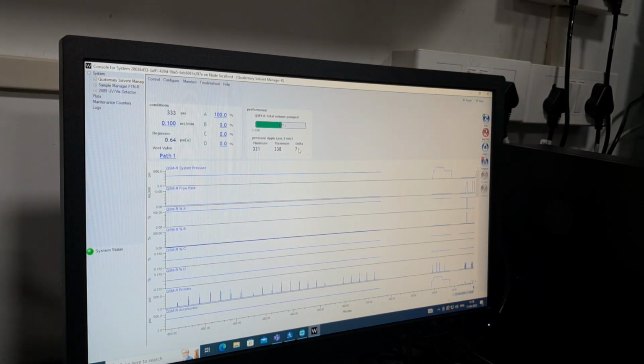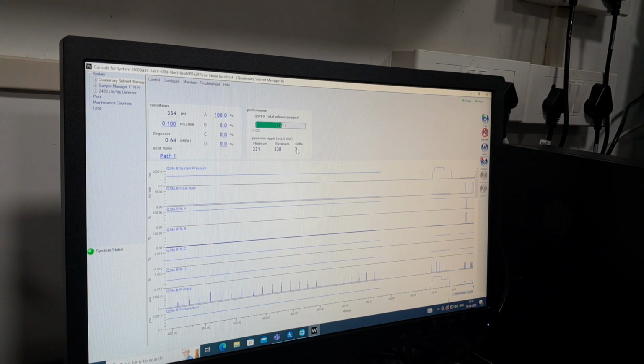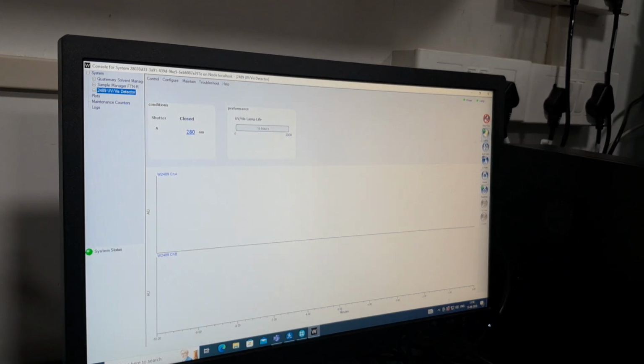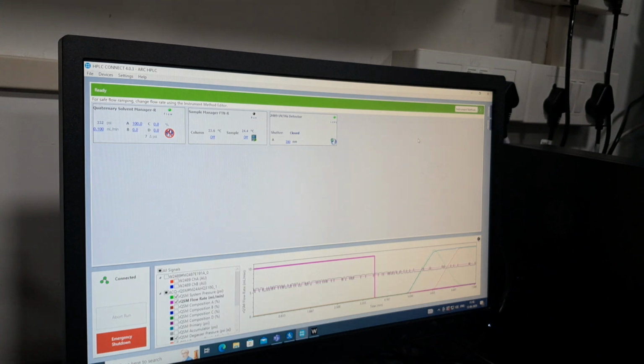after daily maintenance, should we switch off all the instruments completely? It is not recommended actually. So you can only turn off the lamp and the LEDs and everything. The rest will be on power all the time. But the thing is, as you saw today, the power might not be enough.